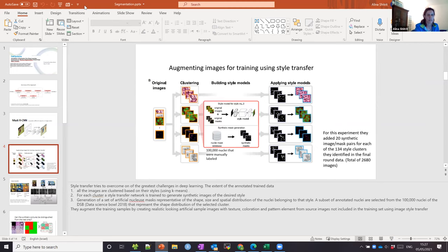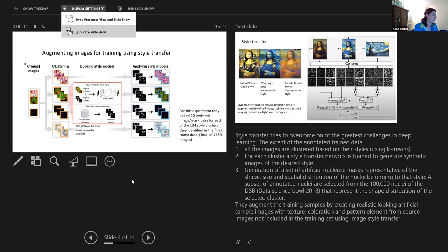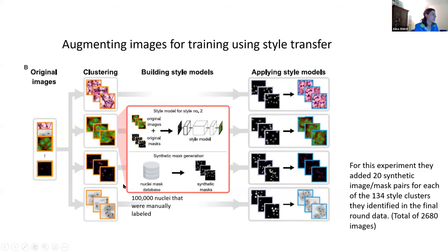So here, as you can see, you have different cell types, different tissues, different markers, different fluorescence. And you can see the same picture with different styles in biology, as I showed in the Mona Lisa example. Does it answer your question?